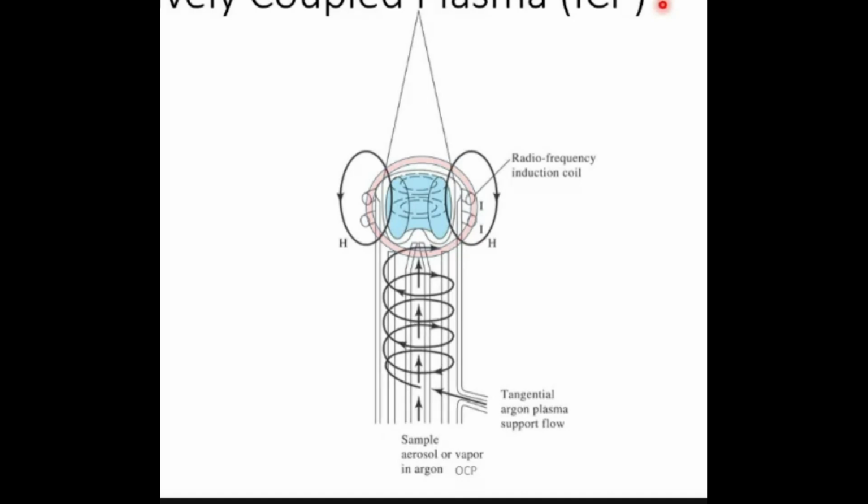They will start moving in a circular path at very high speed, and it will be very difficult for them to escape from there, because an ion which is in motion will have its own magnetic field, and it will be difficult for that ion to escape that magnetic field. Okay, so I hope you can imagine, because of the spark, argon has got ionized. Those ionized ions are moving with very high energy in the magnetic field.